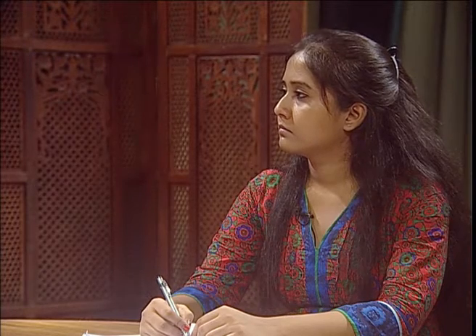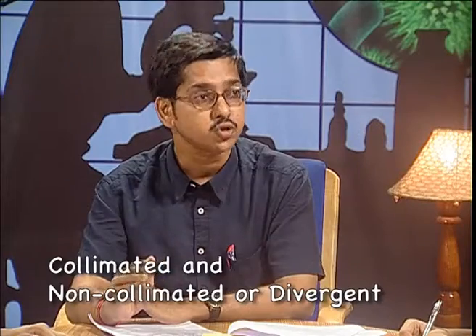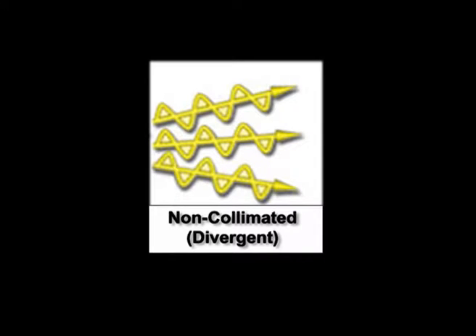Now, coming to the direction of propagation of light from the source, it can be categorized into collimated and non-collimated beams. Collimated beams are those light rays which are coming in a single direction, parallel to each other. Non-collimated beams move in different directions. So, if I want to have a focused light, a collimated coherent beam is the best source of light. And this can be nowadays obtained using lasers, which I will introduce you to in the later part of this course.